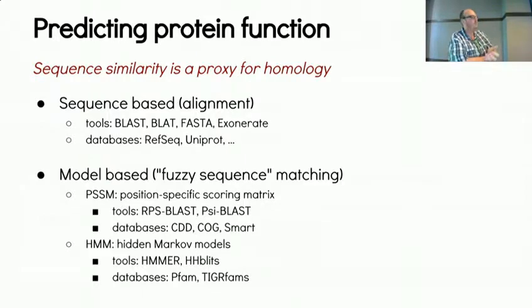So how we do it is to use sequence similarity to figure out what its function is. We have proteins that we know what they do, because they've been characterized. And if our sequence is pretty similar to that, we'll just assume that it's doing the same thing. Most of the time it's probably right because all these things had common ancestors, and a lot of these gene structures are conserved. There are even genes between human and bacteria that are conserved. So using sequence similarity is our main tool to try and figure out what our proteins are doing, by basing them on what we know about other proteins that do have real evidence.